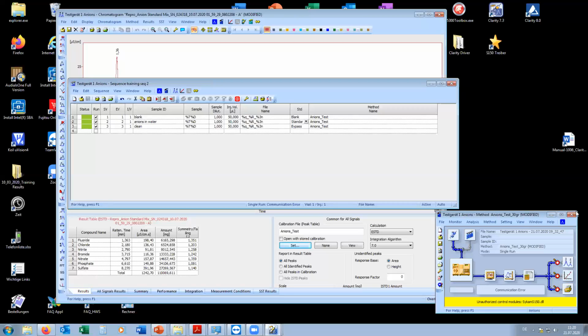Clarity software is here. This one Clarity software is this one, right? Yes, that's the software key also, I think. No, this is the pen drive. Clarity software version 8.2.02. Okay. We will try our level best by reading the manual and following your suggestion. Good.